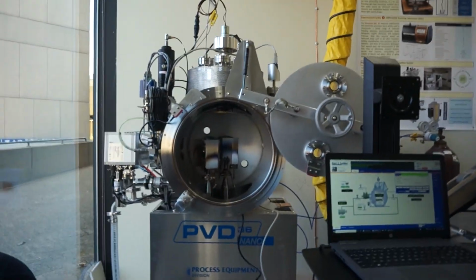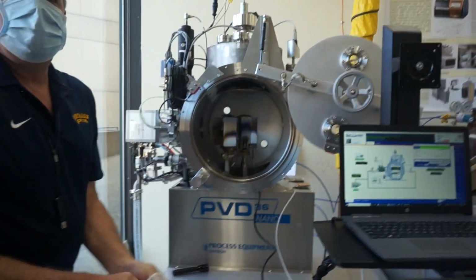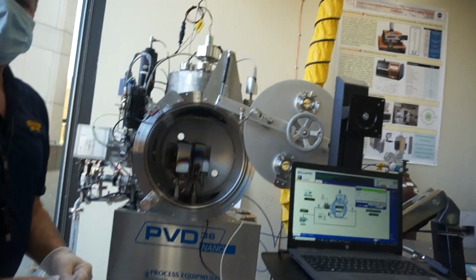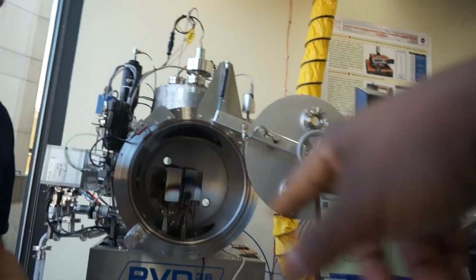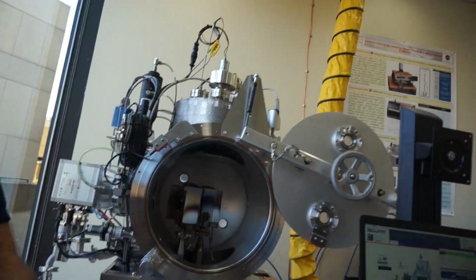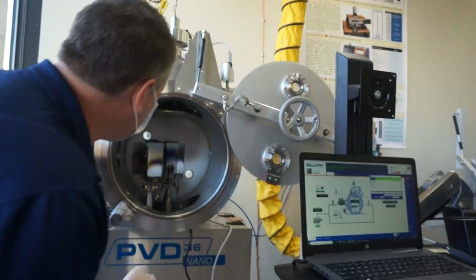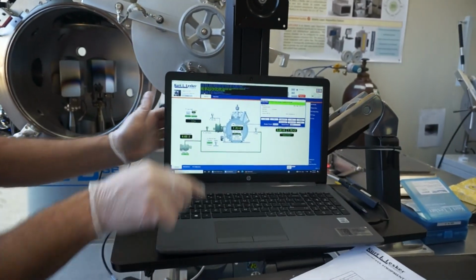Yes, I got it. How much experience have you had with sputtering? Years. That tool right there is from the 1980s. Okay. And I think nothing inside should be touched with just hands. Yeah, you actually want to use gloves. I know. I stumbled across another lab in a couple of corners of the building here, which had an old Lesker bell jar and an AJA.